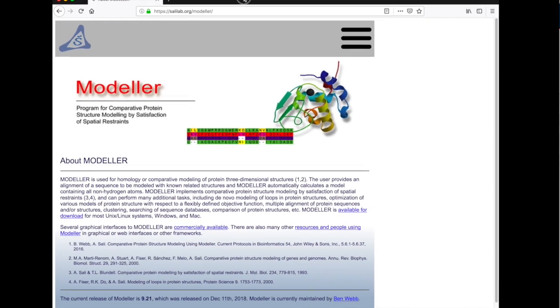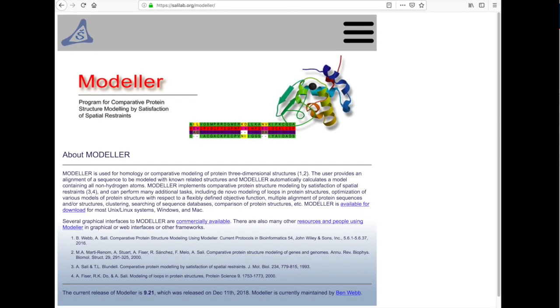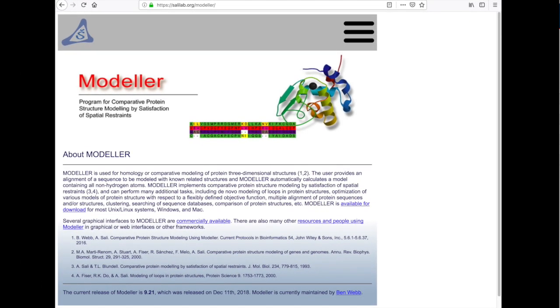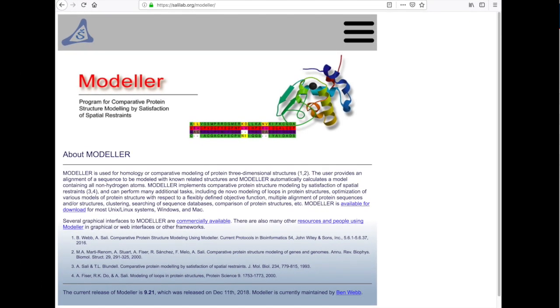Modeller can be found at this website. You may want to google it or look on canvas for the particular link.